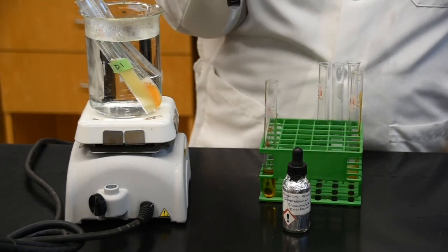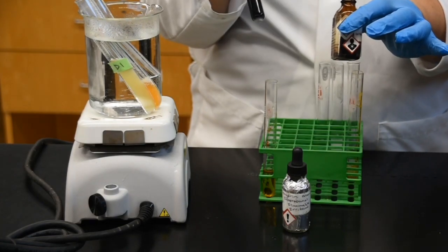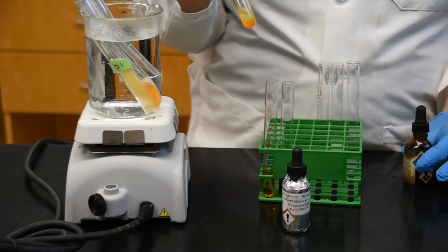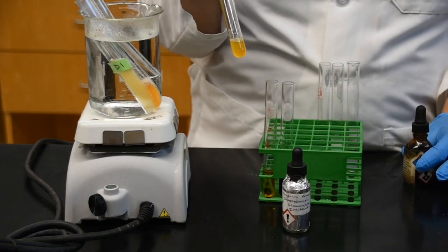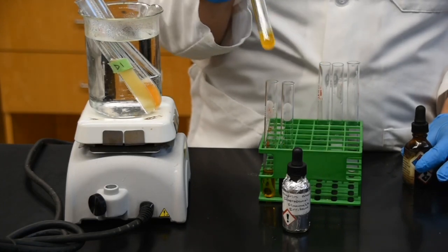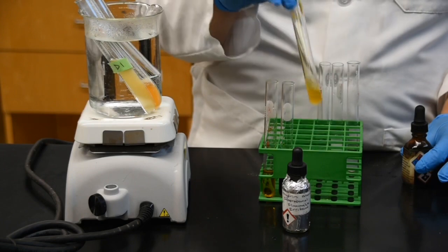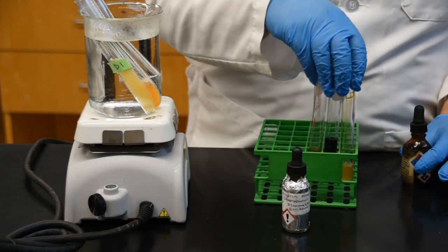Second, look, that was our starch sample. When I added the Lugol solution, you can see it changed to that bluish black. Third sample is our protein sample. And again, notice that the protein also stayed that yellow color without any color change, indicating that our protein sample has no starch present in it. So here we go, this is our sample right here.